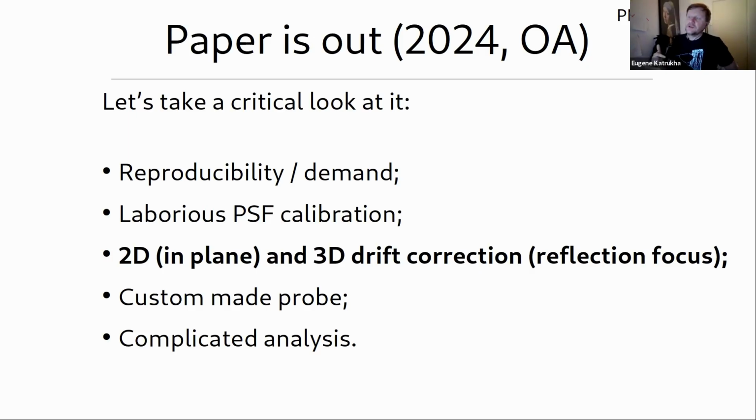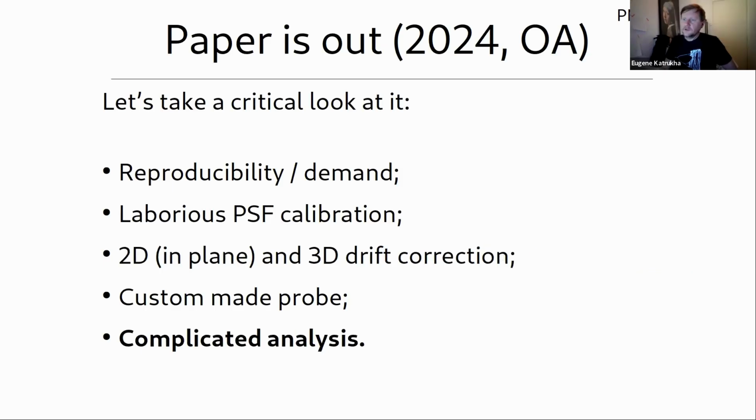We also share the code and everything for the paper and analysis. And there is a macro which makes all these acquisitions possible. I didn't mention it: right now there is no store focus, recall focus function, but I guess you can just add it and use these things. The other thing, well, okay, I'm jumping a little bit, but that's fine. The analysis is relatively complicated. The fitting is okay, but then again, you need to deskew all these things.